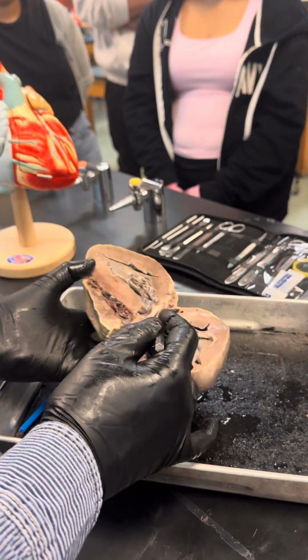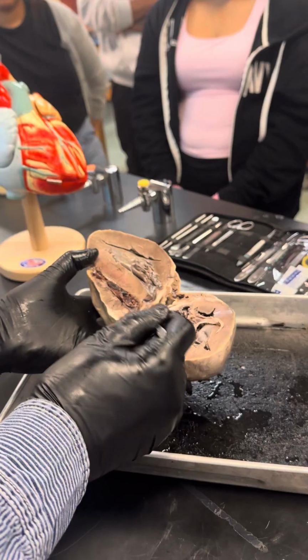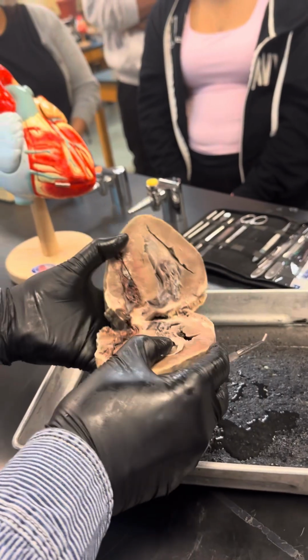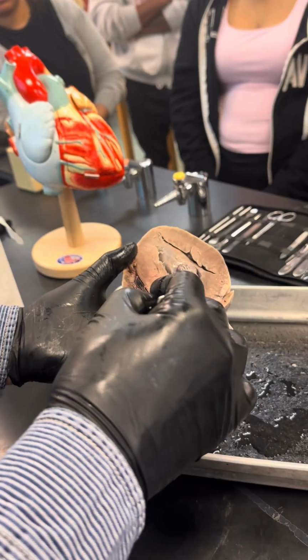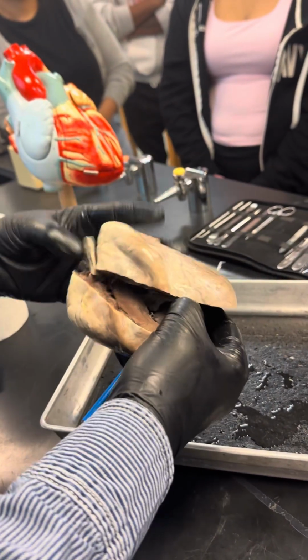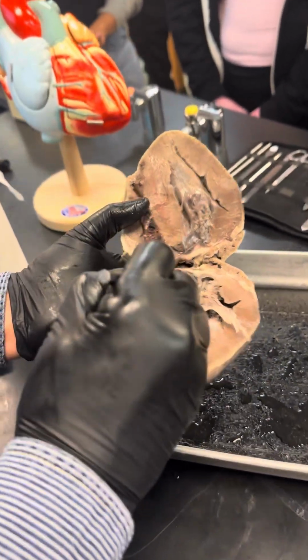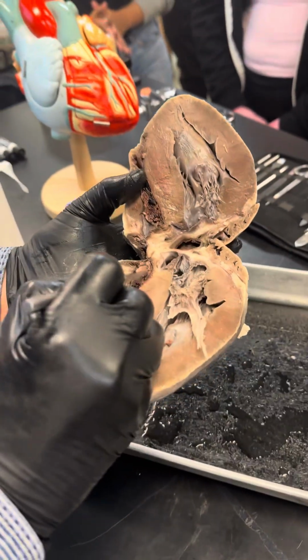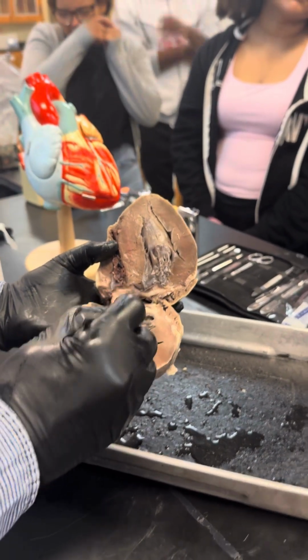And this one is the upper chamber. It is also always shown as you dissect the upper chamber. And these are called, see right here, the bicuspid valve. So I'll show you. Here you will see the bicuspid valve. These are the tricuspid valve right here, and the bicuspid valve will be here. These are the bicuspid valve, the mitral valve.